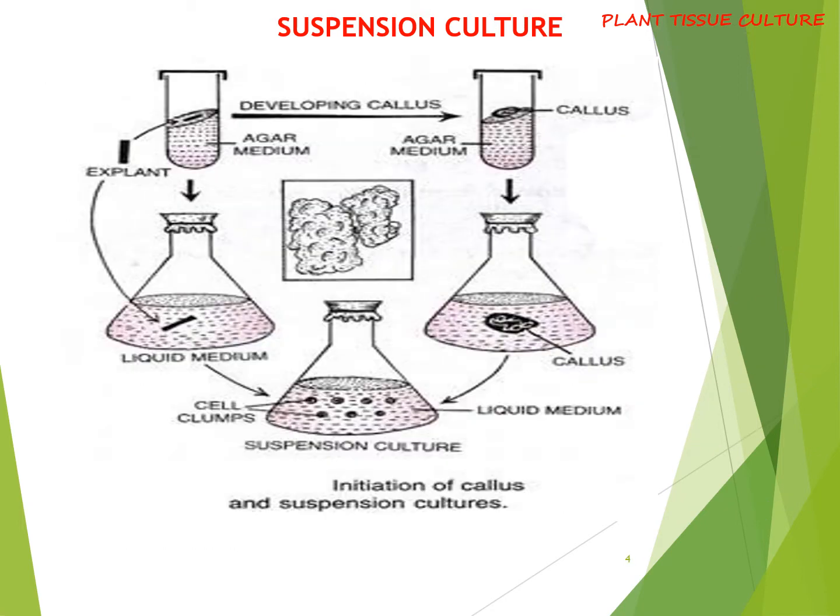The figure here shows a diagrammatic representation for starting a suspension culture. In some cases, the explant is directly inoculated into a suspension media to start the suspension culture. However, the main disadvantage of this method is the probability of high contamination. So, in most cases, the suspension culture is started with a callus.